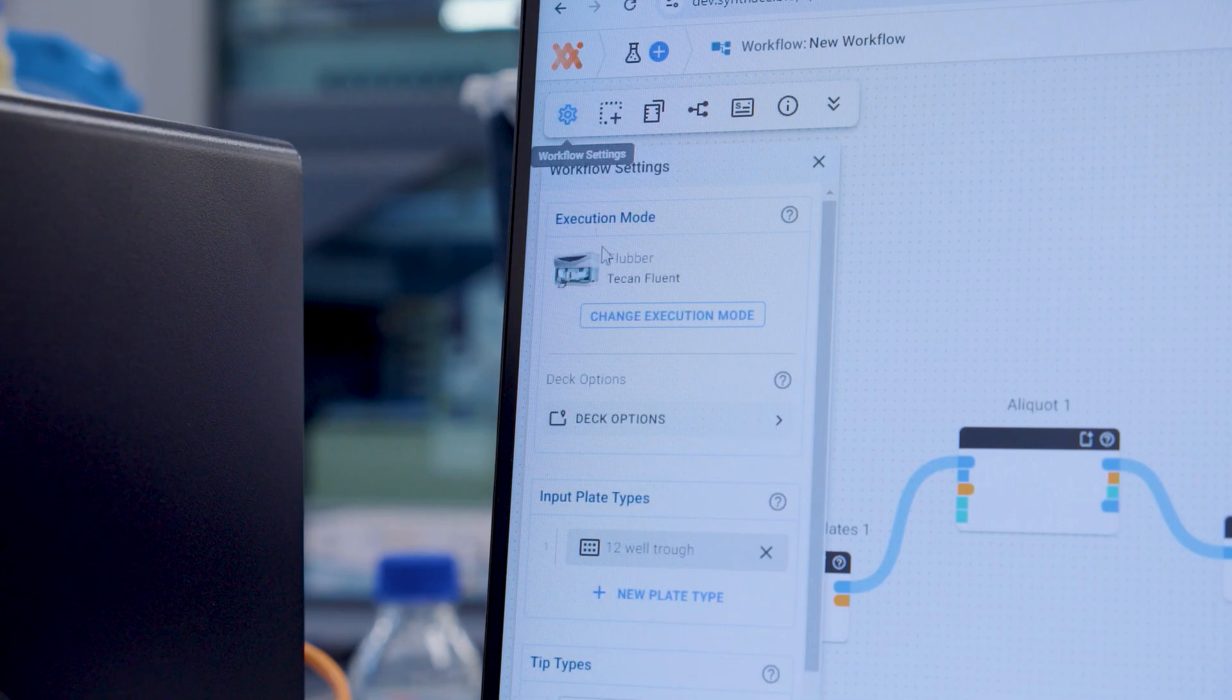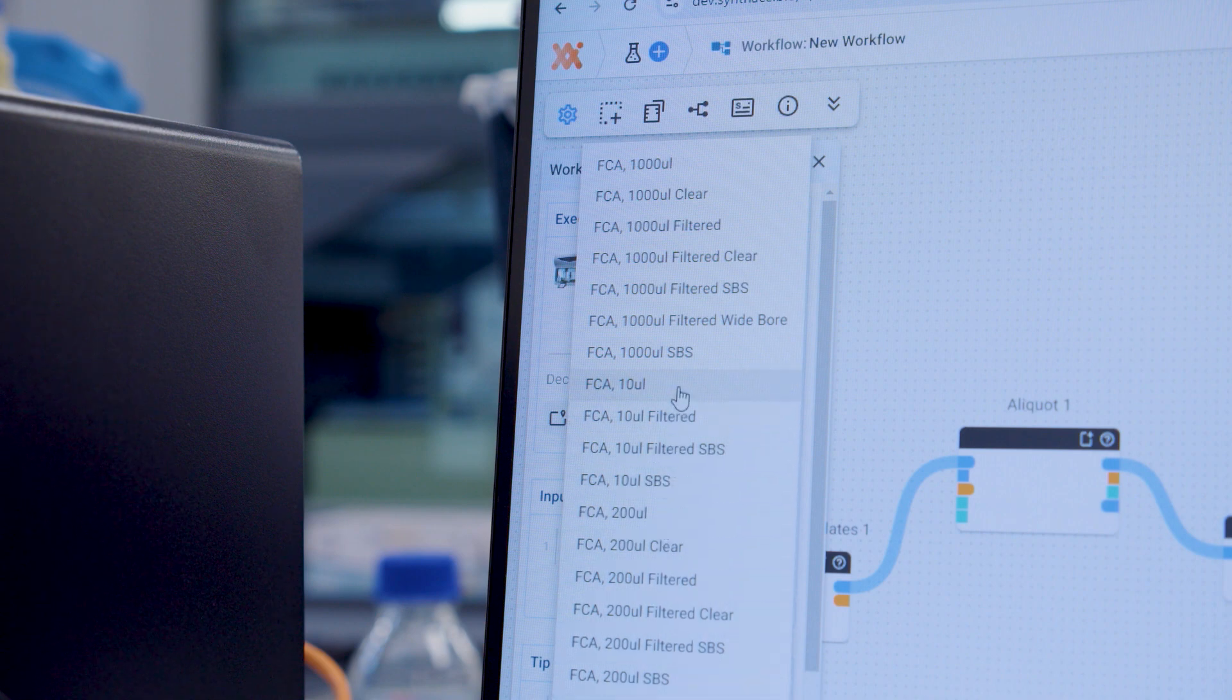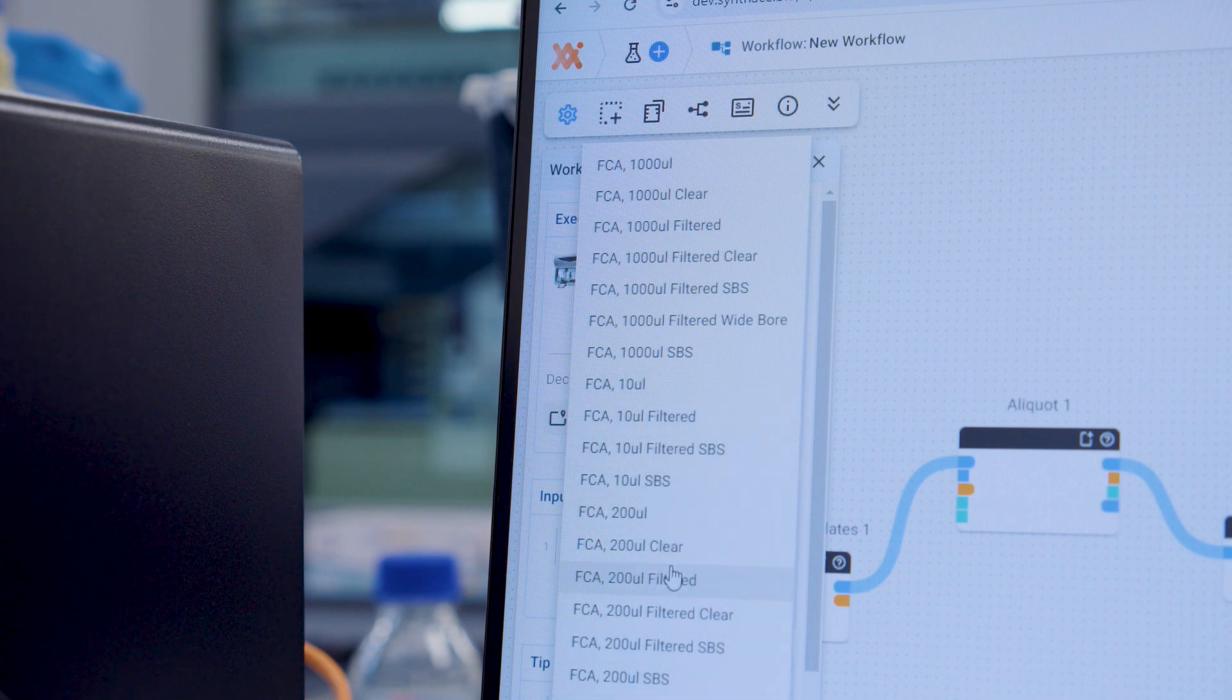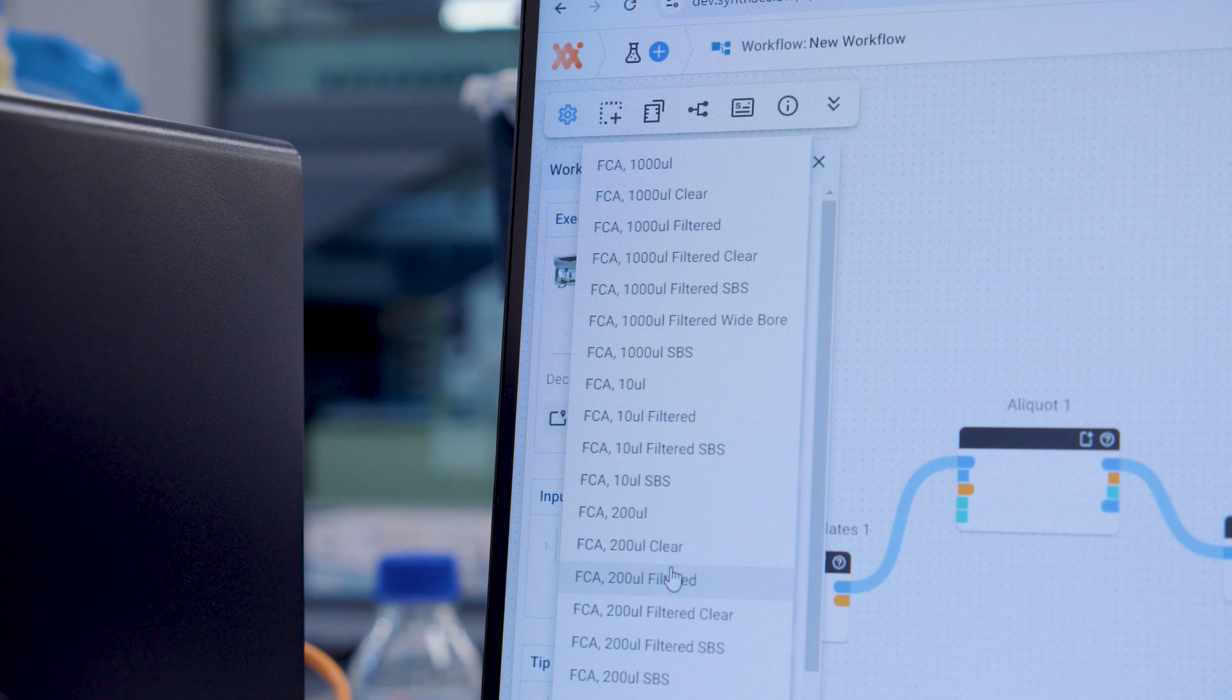If you're using disposable tips you can also choose where your tips will be taken from in the workflow settings, whether you want them to be taken from an SBS tip box or the built-in tip carriers.